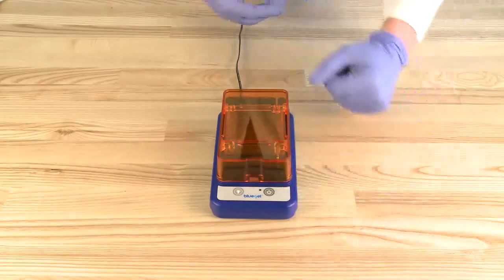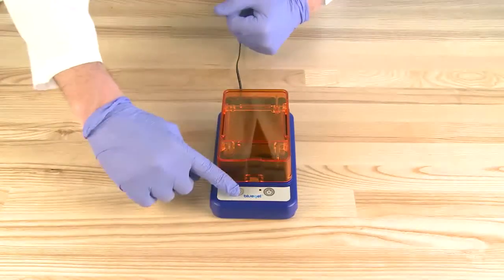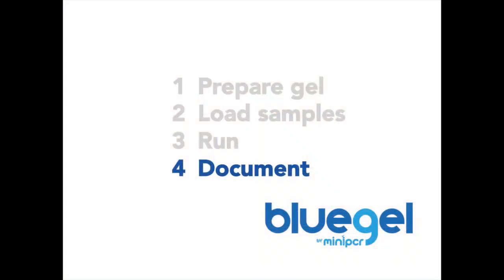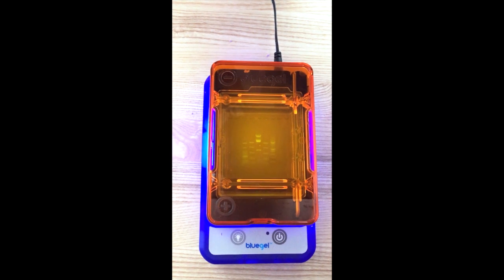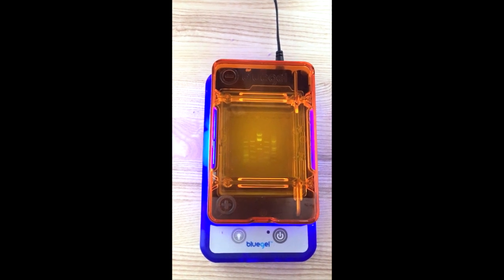After the gel has run for a few minutes, you can take a look at your DNA by turning on the light. Document the run by taking a picture through the orange cover with a phone, tablet or other capture devices.